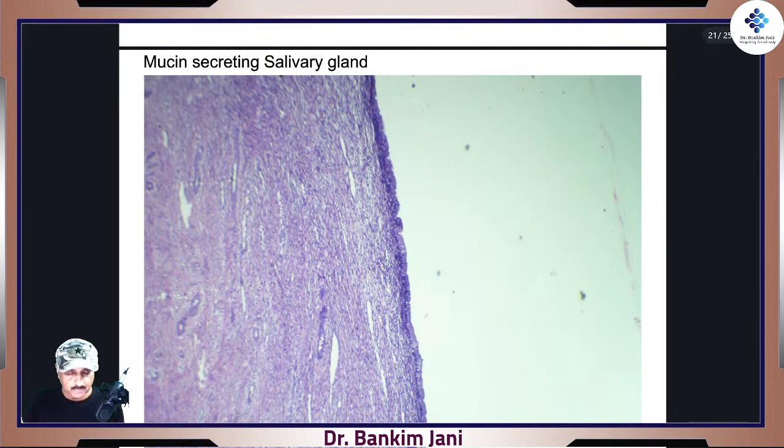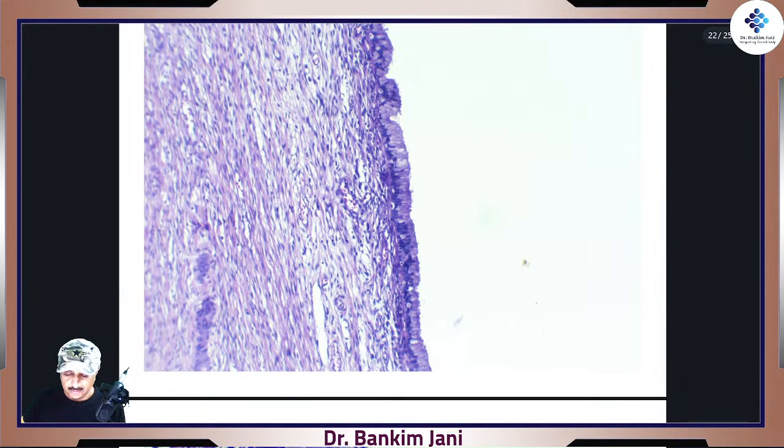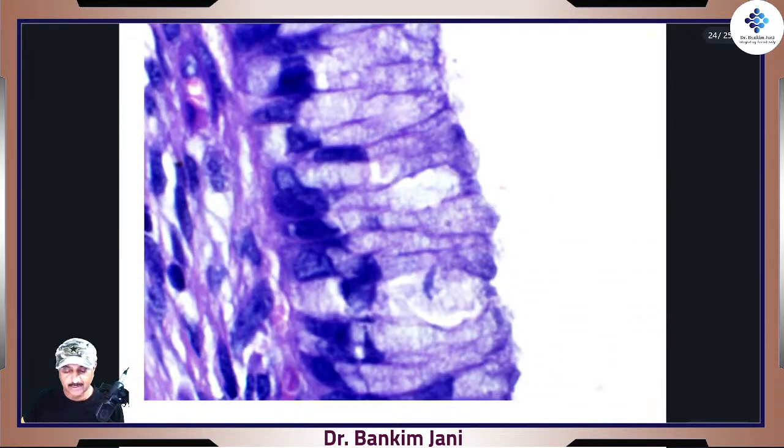These are mucin secreting salivary glands. Again, we zoom in, and yes, classical. No explanation needed. All the characteristics are there.